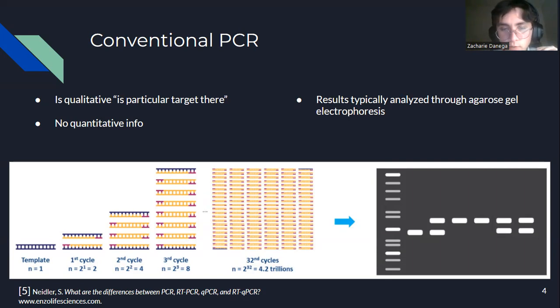Like you can try to take how much DNA you've ended with and determine how much DNA you've made per cycle or how much you started with. But there are a lot of flaws, a lot of things that will prevent that data from being accurate. Like you don't know if the polymerase actually faithfully made copies. You don't know if errors were made. You don't know if it actually made double the amount each cycle. Just a bunch of different things.